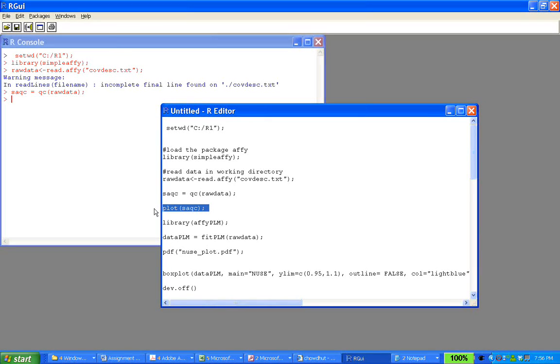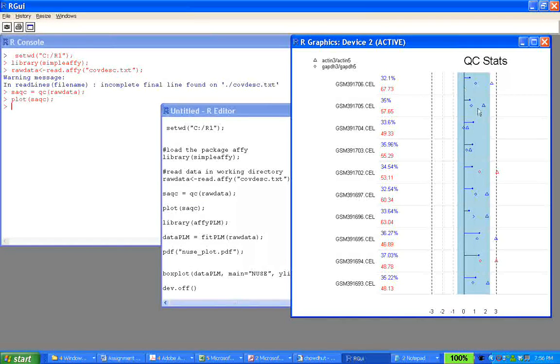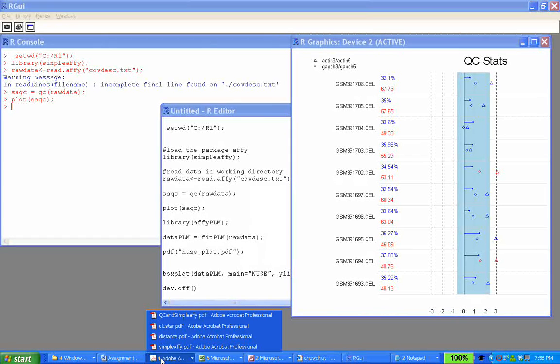So now let's plot it. Now you know what this blue region means, what this vertical delta means, what the circle means, what fold change means, and what this present call versus the background ratio means. So I also told you the file to look up, right?